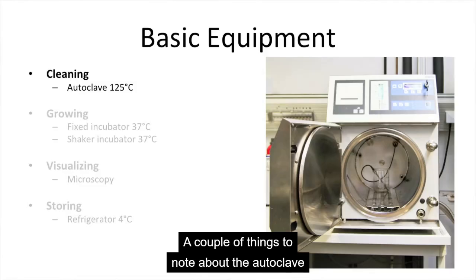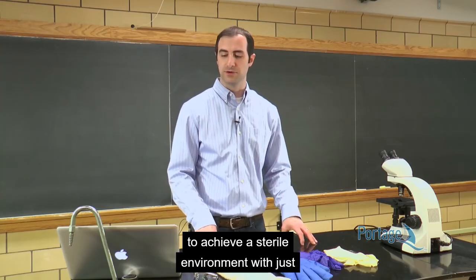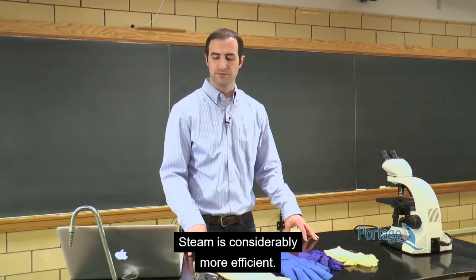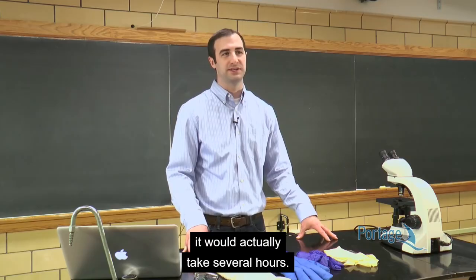A couple things to note about the autoclave: it is not just dry air. When you look at the differences between trying to achieve a sterile environment with just dry heat versus actual steam, steam is considerably more efficient. In about a couple of minutes with hot steam, you can achieve a sterile condition, whereas with hot air, it actually takes several hours.